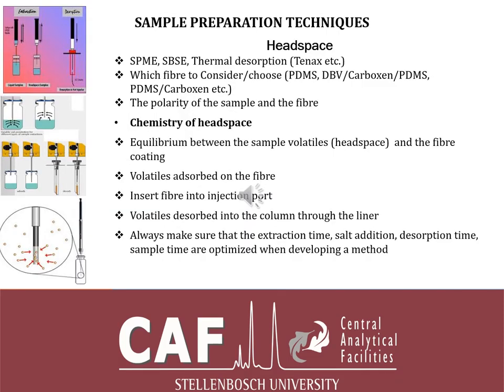Headspace is one of the widely used forms of sample prep techniques nowadays because of the potential that it possesses. Advantages: you can work with minute samples. If you don't have a lot of sample, you don't have to use a lot of solvents if you're doing direct SPME. And we'll talk also about some SPME techniques, like for instance fiber derivatization. And then SBSE, we're not going to talk a lot about that, but what I can say about SBSE stands for stir bar sorptive extraction.